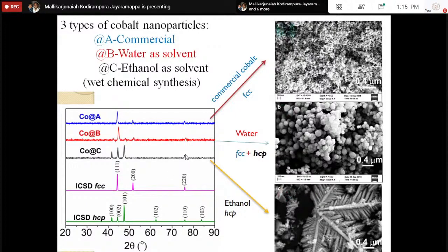It is hard to identify. Only through our NMR were we able to identify the composition, or how much percentage of HCP was present in the system. That we were not able to do using XRD. Therefore, IFNMR plays a major role in identifying phase composition compared to XRD.